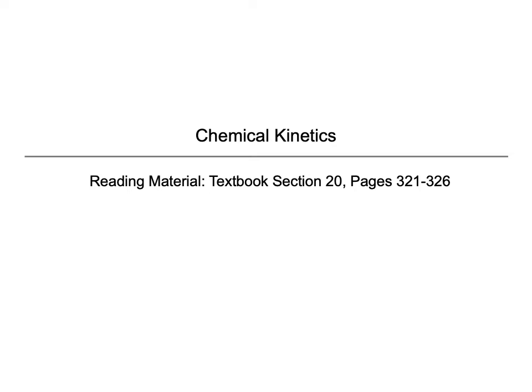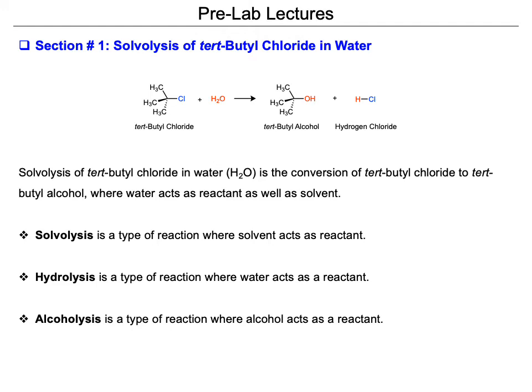Hello everyone, in this session we are going to talk about chemical kinetics. So we are going to start our lab with the explanation of the mechanism of this experiment. We are going to review the solvolysis of tert-butyl chloride in water.